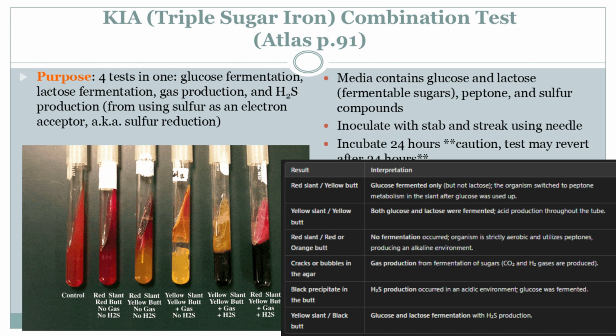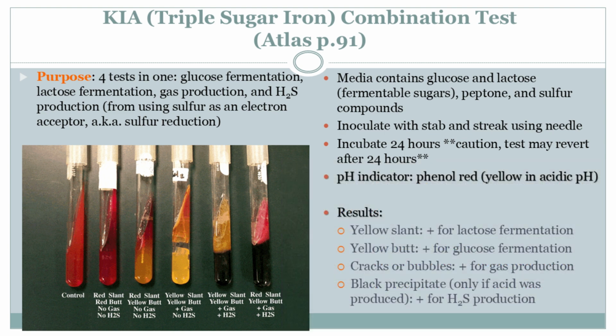Okay, so we've got this test and all this information we can get from it. Why do we care? Why is this important? It's important for a lot of reasons. Let's say you're a doctor and you have a patient who comes in with an infection. You need to figure out what bacteria is causing that infection, to know how to treat it. You can do this test, and it can help you narrow down the possibilities. It's one tool in your detective kit, and from there you can do more tests to figure out exactly what you need to do.